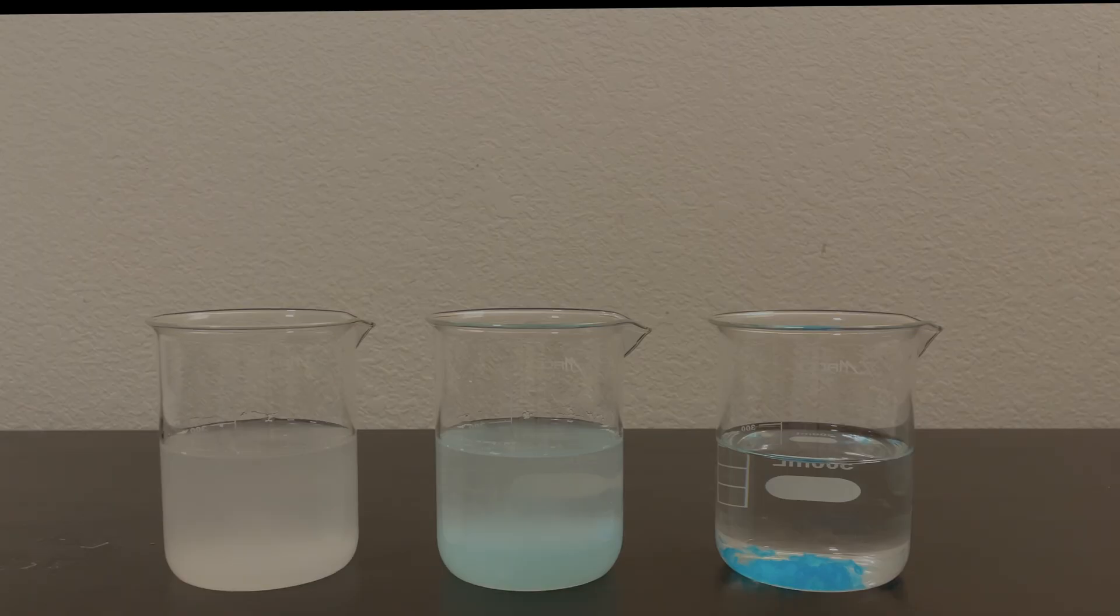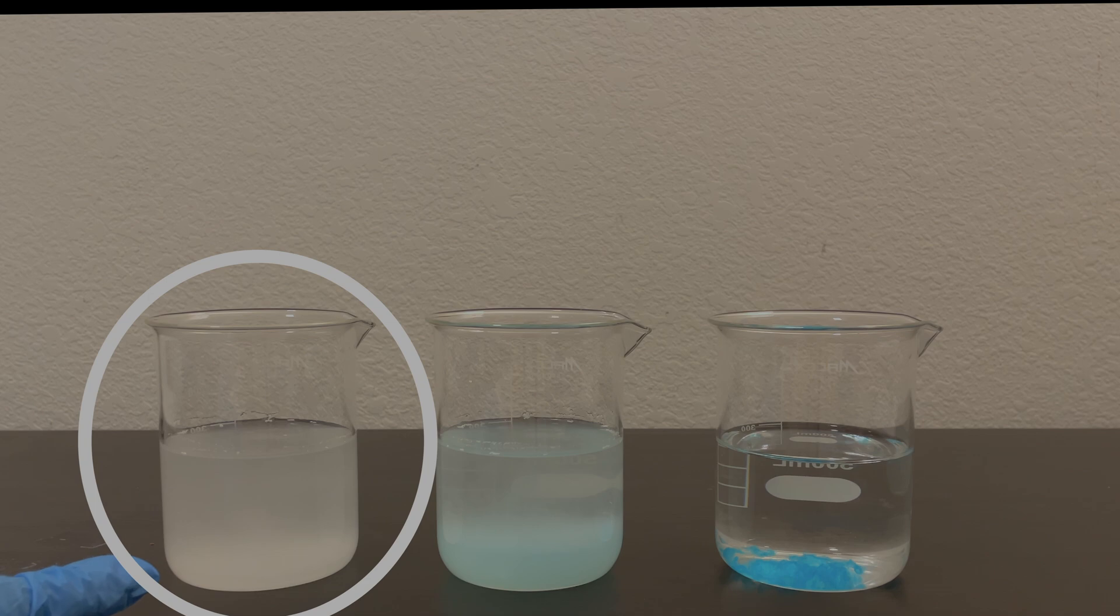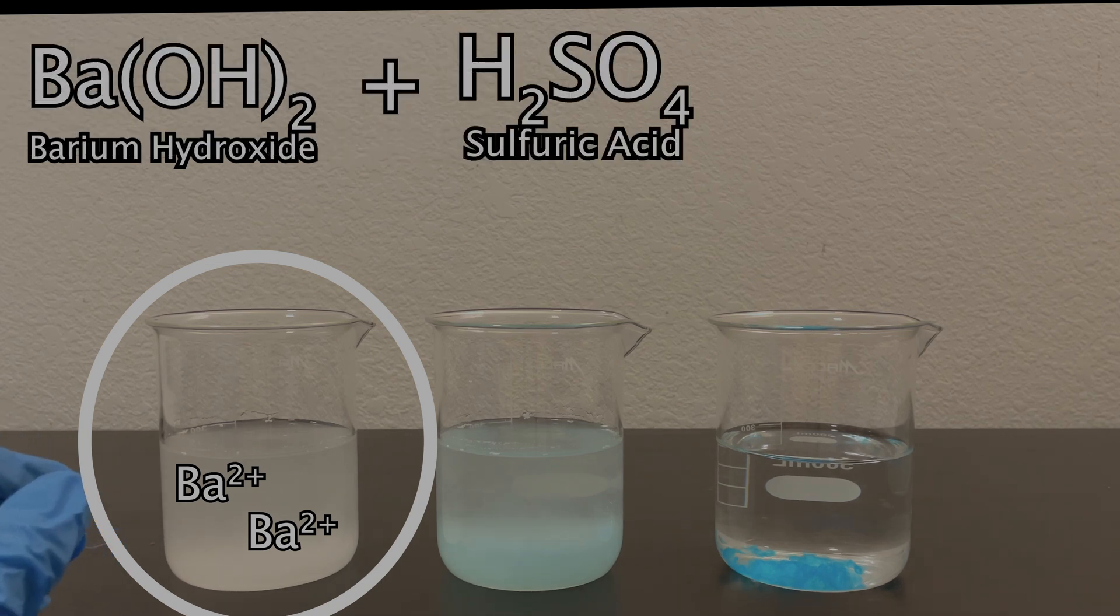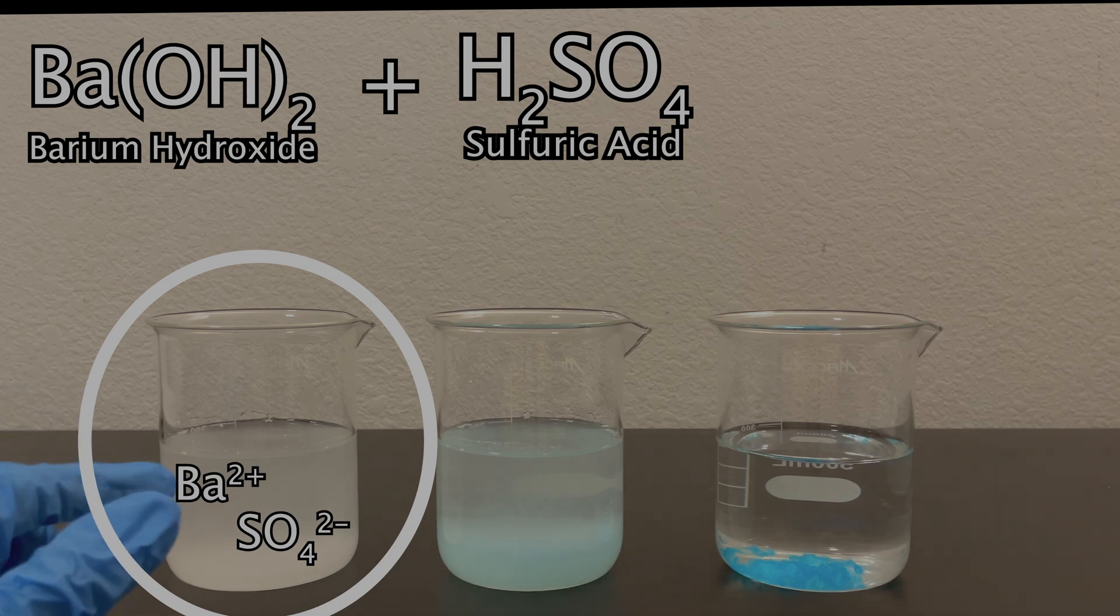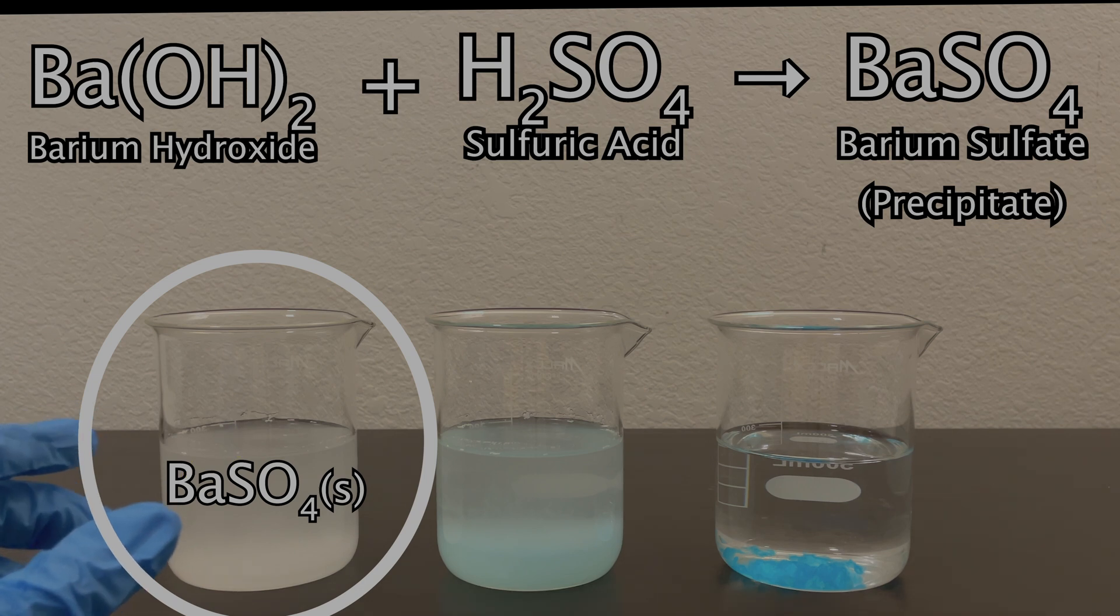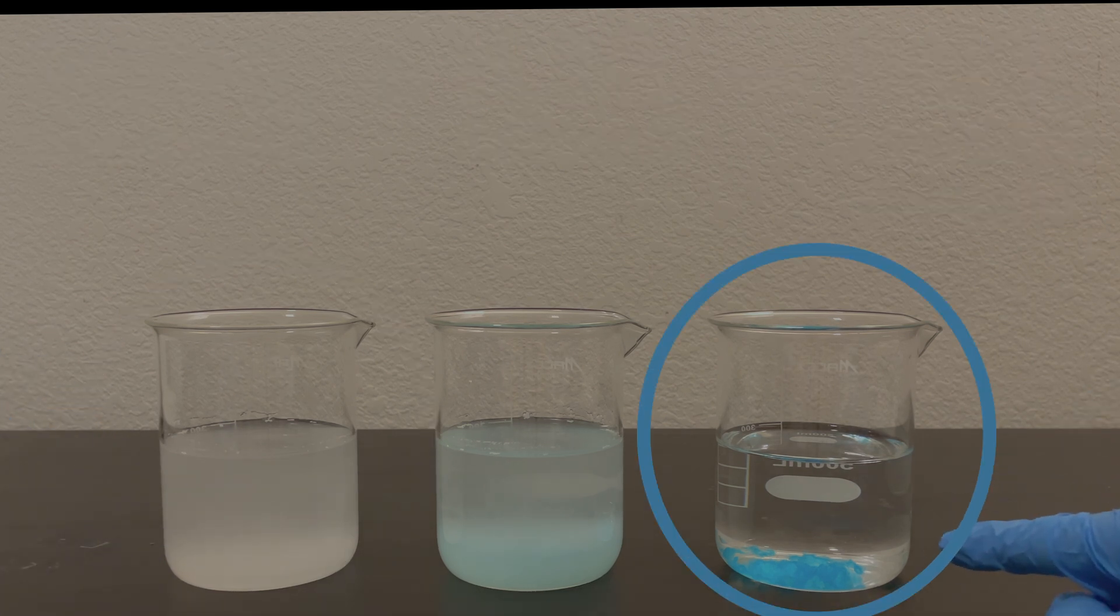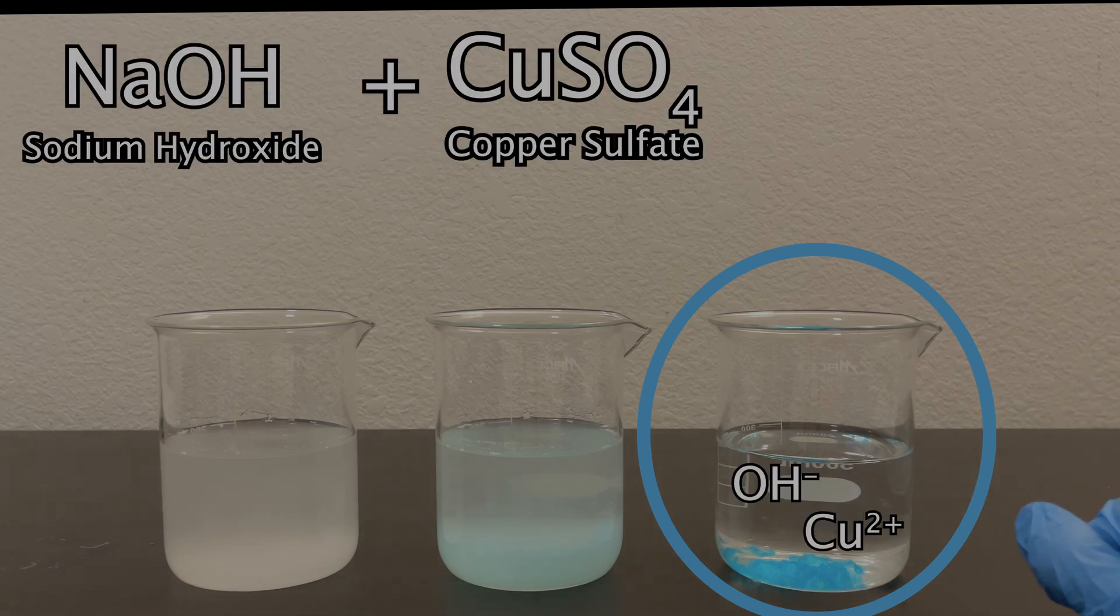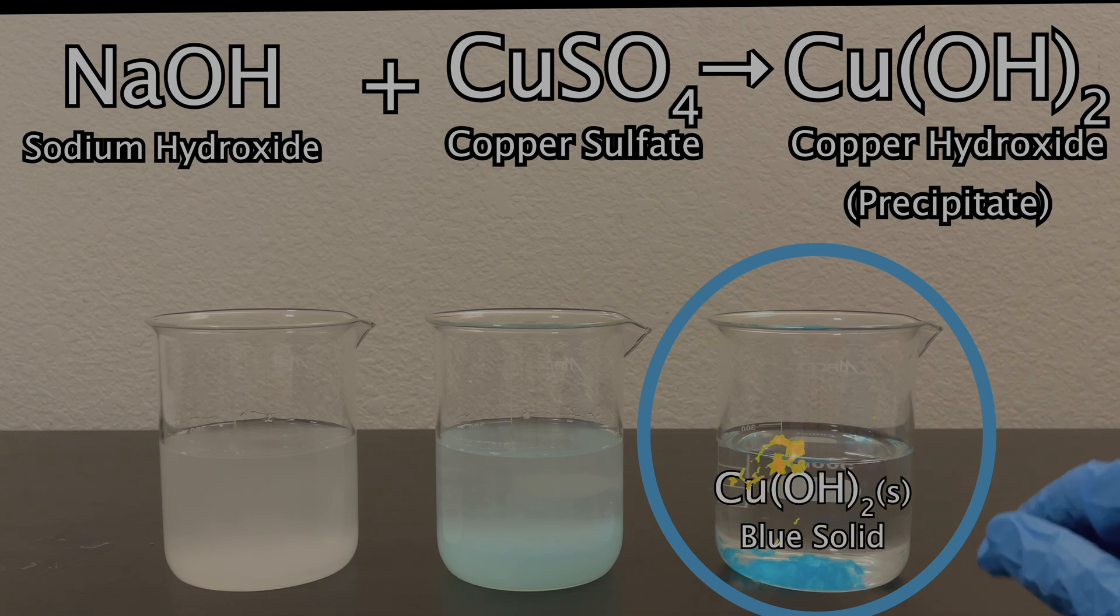What happened here is that in the leftmost beaker, I started with a solution of barium hydroxide containing barium two plus ions, and then added sulfuric acid, which contains the sulfate ion. Together, they formed the insoluble barium sulfate compound, which is a white solid. On the right, I started with sodium hydroxide and added copper sulfate, which forms the blue copper hydroxide precipitate.